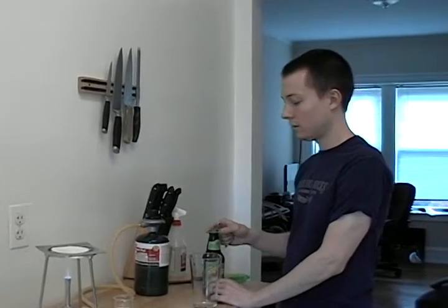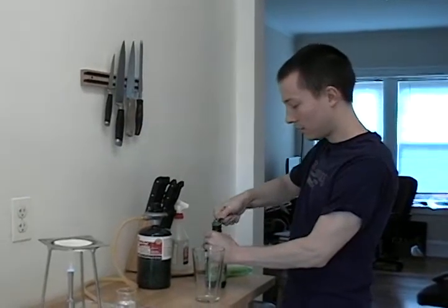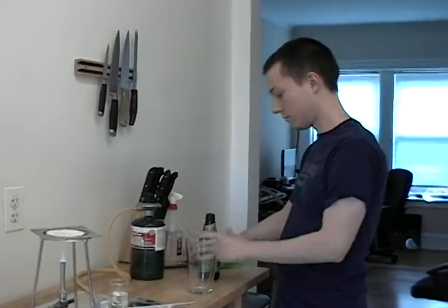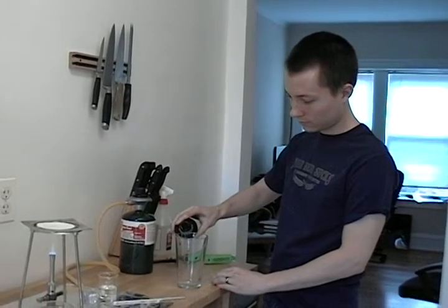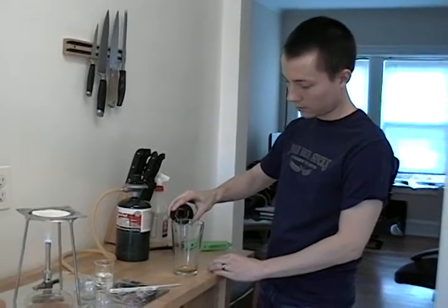Plate's all set. Now we need to actually get the yeast from the bottom. So pop open your favorite beer. Pour it out really slowly so you don't disturb the yeast at the bottom.